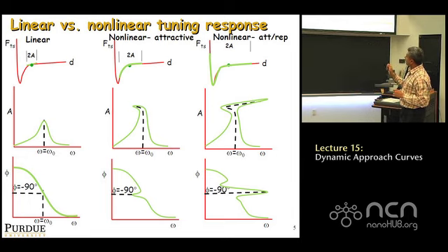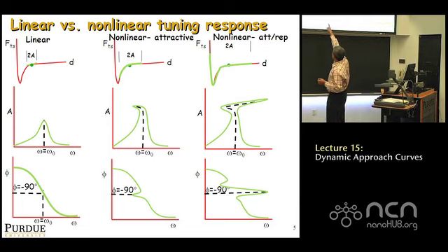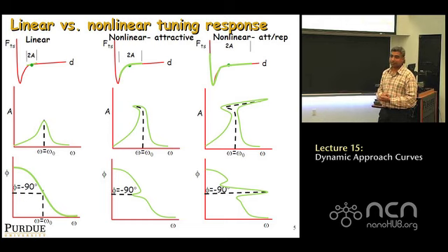And accordingly, if you do simulations, and you'll do this on Thursday, when you do sweeps, you find that the phase distorts as shown here in a very interesting manner. And the 90-degree point is actually at this little cusp here that happens. So just simulations are going to show this to you, okay? And experiments like I showed you, when you do tuning near a surface, you actually pick this up, right?